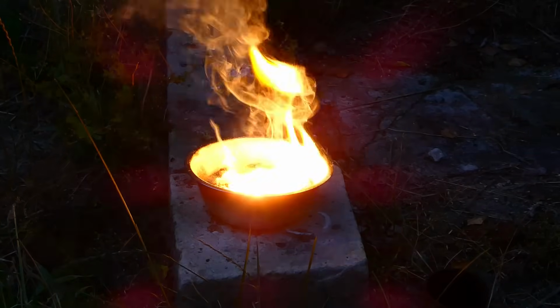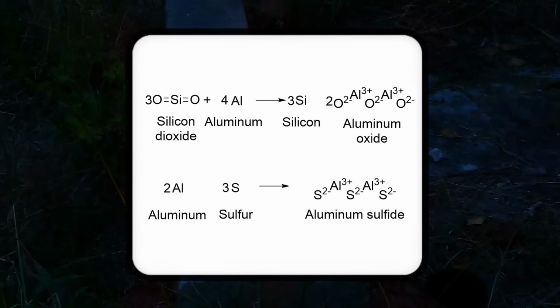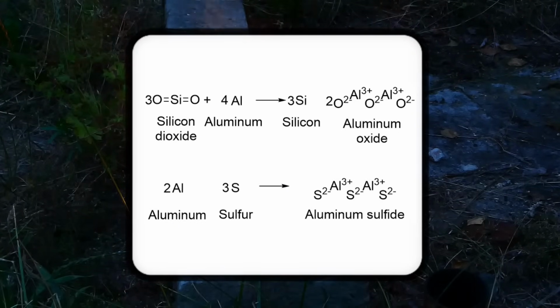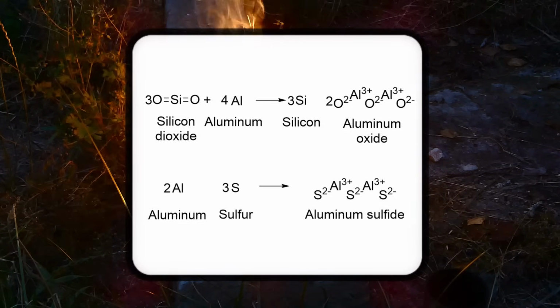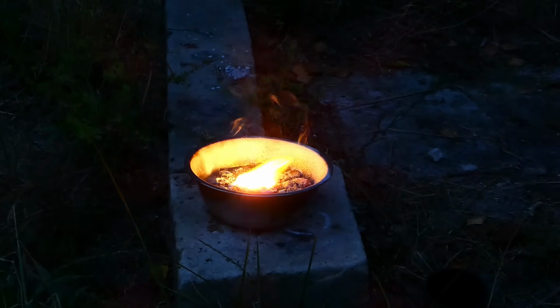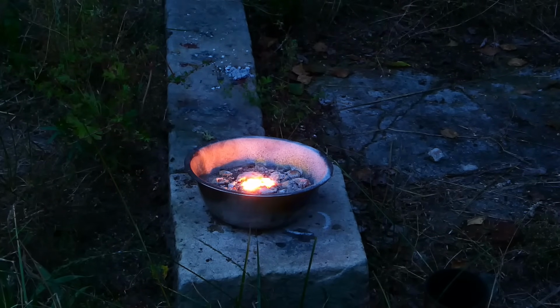The reactions that are going on in here are pretty simple. The silicon dioxide is reacting with aluminum, producing silicon and aluminum oxide. The excess aluminum reacts with the sulfur, forming aluminum sulfide. All of the products melt, forming a small glowing puddle that looks just dangerous.